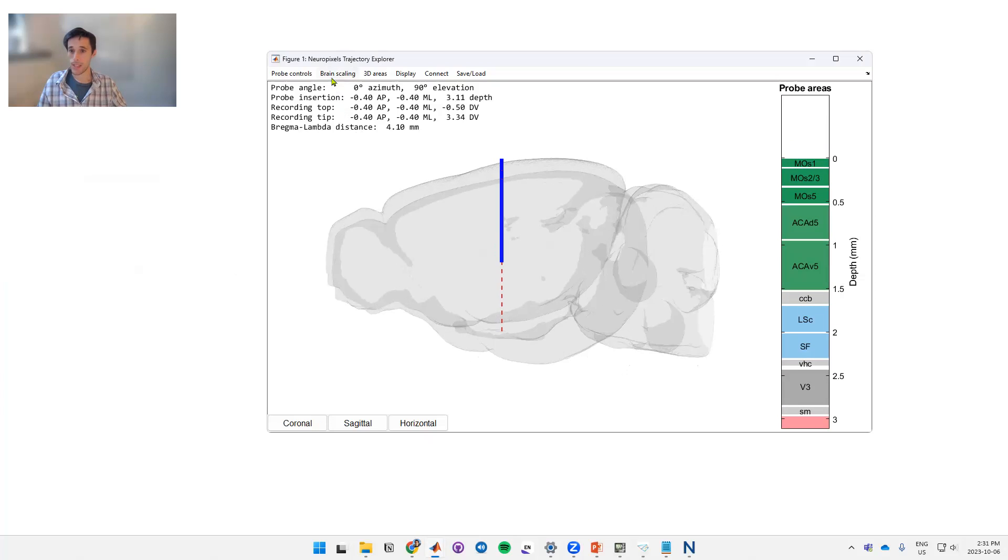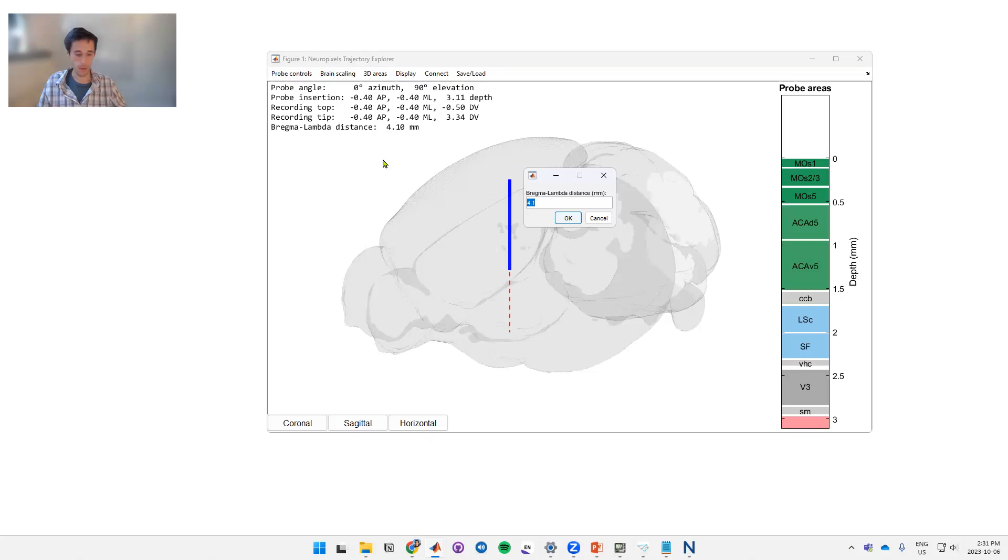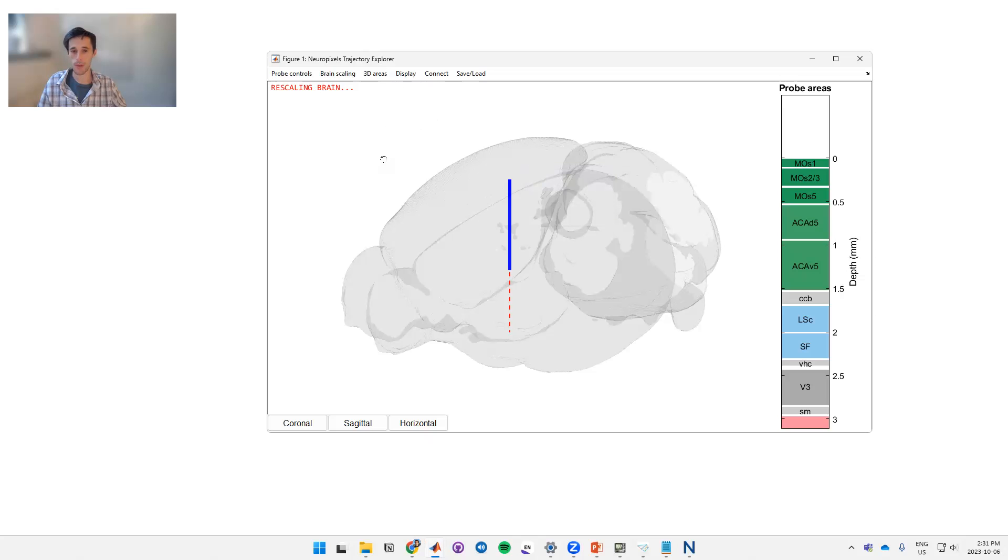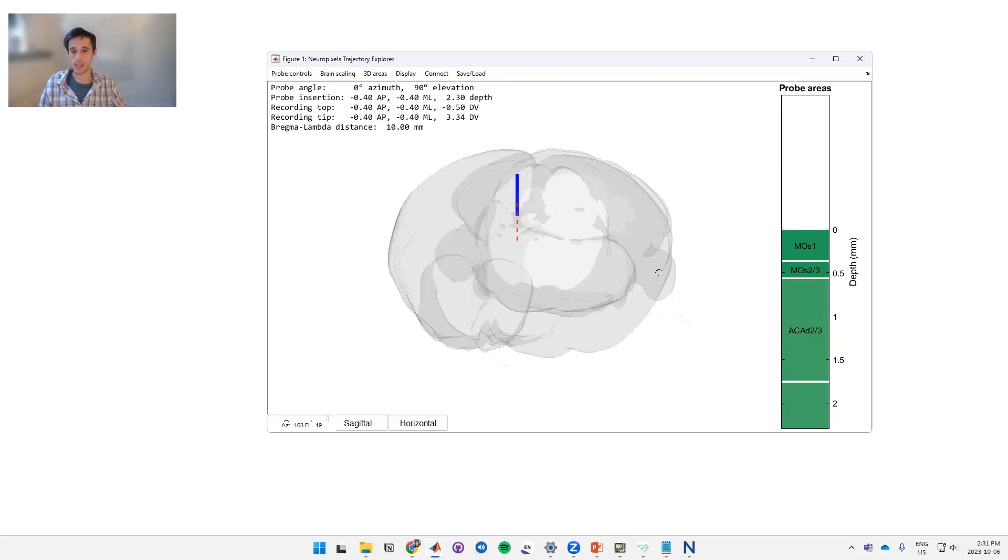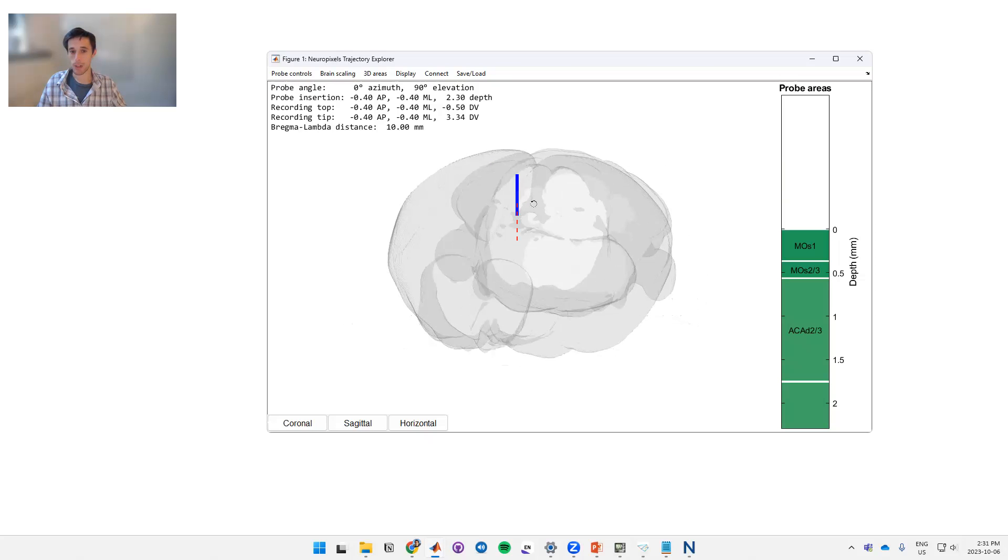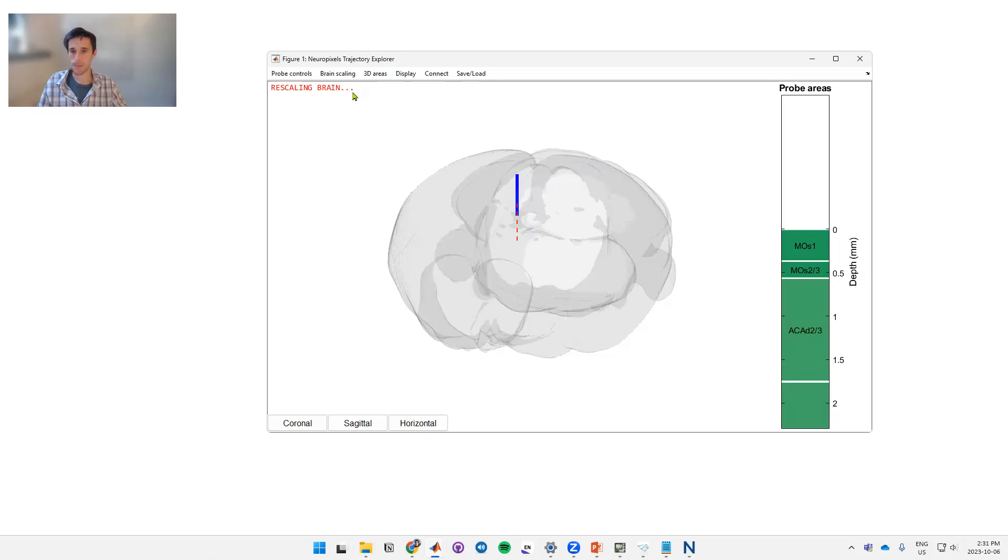Brain scaling. If your animal is larger or smaller than the average, then you can change the size of this atlas. So the default here is 4.1 millimeters. If you have a very large mouse, let's say we can set this to some large number, in this case 10 millimeters. Now you can see that the brain is much larger compared to the probe as previously. So we'll put this back to the standard which is 4.1.